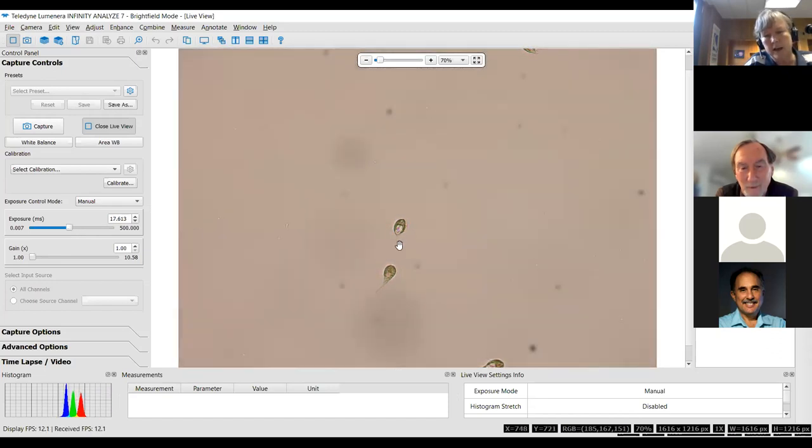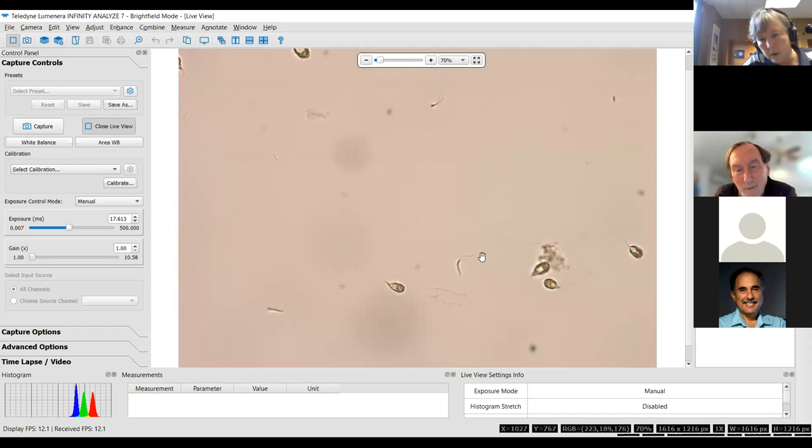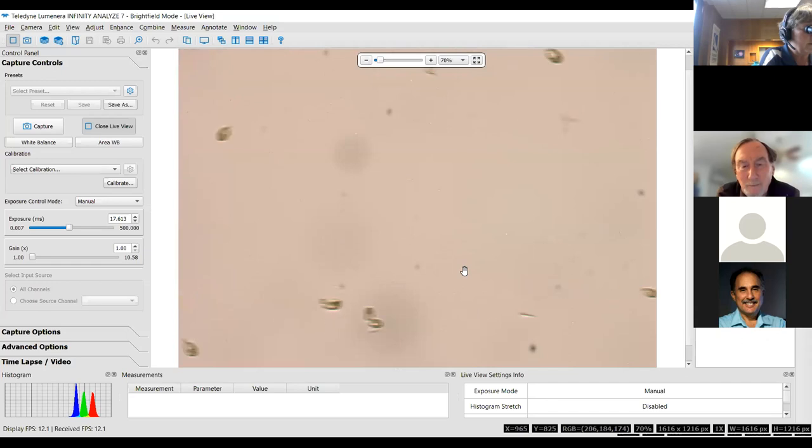Here's that central large vacuole, right? That is really typical of the chrysophytes. Sometimes there's an orientation where it's not as obvious, but you almost always can pick it out. There. And again, not seeing hardly any of the colonial stuff. This is Monorhaphidium. It has a little break in the center of the chloroplast. And there's that long tail, the central vacuole. What's the little one in the middle there? Is that a Monorhaphidium? Yeah, it's a Monorhaphidium. But you're not going to see these things hardly ever stay colonially in what would have been the full colony.